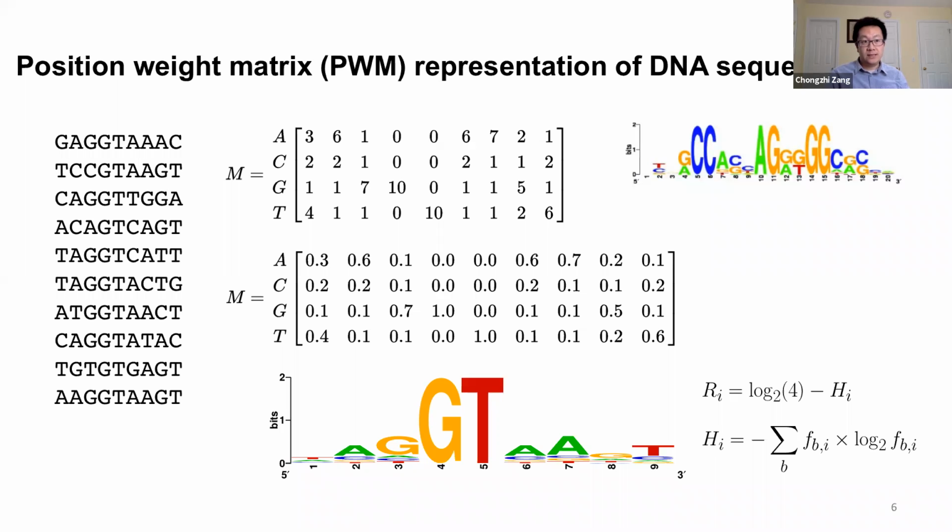So that will be a discovery method for identifying potential cofactors or other information associated with these binding sites with the transcription factor that we ChIPed for. So we usually use a position weight matrix to represent a DNA sequence motif. This type of sequence motif logo we can frequently see in DNA motif analysis or a lot of the DNA sequences.